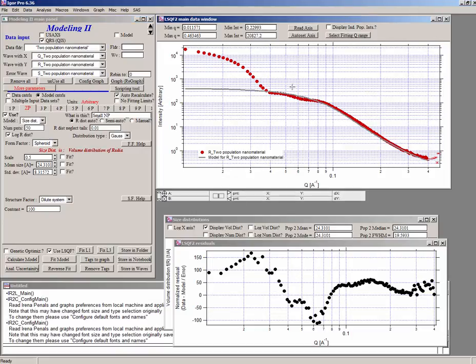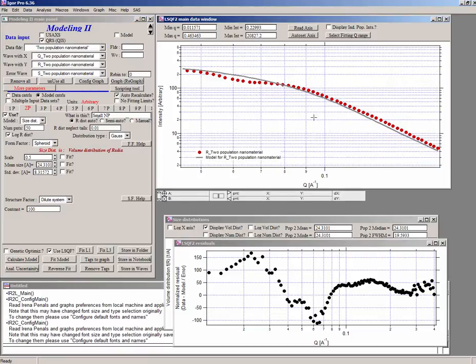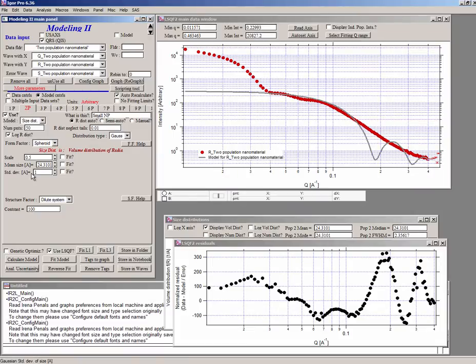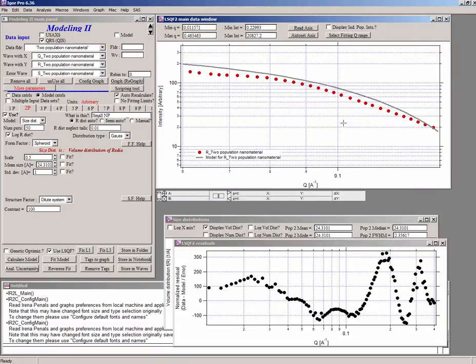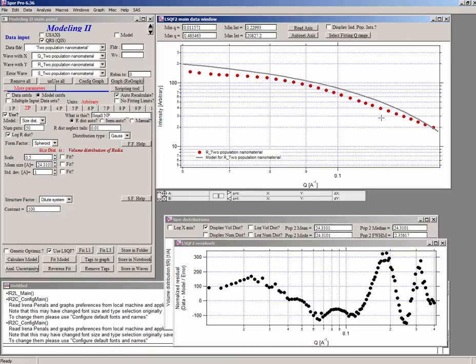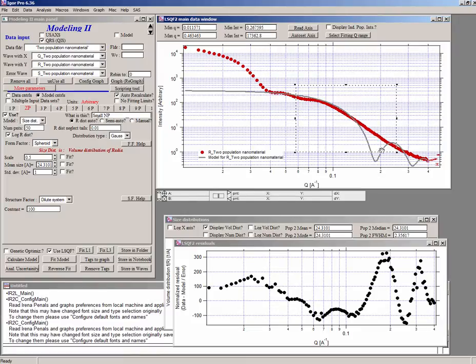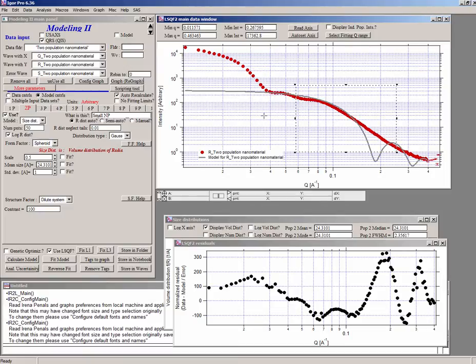Now notice one thing is, I'm going to zoom in the area. Notice that this is a curve for a size distribution here. Even if I make the standard deviation very, very narrow, you will see that the data themselves, the measured points, are sharper than the small angle scattering. Basically they are sharper than the sphere, the Guinier area of the sphere. And what that means is that most likely this data set is aggregated or is concentrated enough that there is a structure factor in there. So we're looking on particles which do have some structure factor.